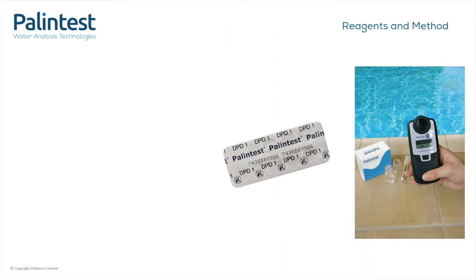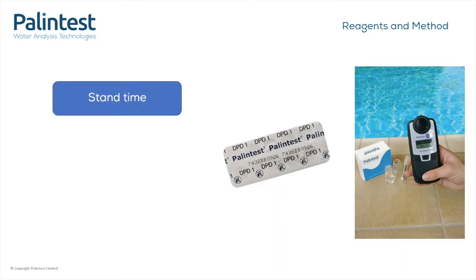The first thing we always check when a query comes in is the method and the reagents. There are a few things that we've spoken about in previous webinars, like making sure that you use in-date reagents and ensuring you use them in the correct order where necessary. But this is our tech support checklist, and these are the first things that we try when a query comes in. What I'll give you is our top three things to check when carrying out a photometer test. The first is to follow the method carefully. One of the key things is making sure you adhere to any stand time instructions. The stand time is what allows the chemical reaction to occur and the colour to fully develop, and helps to ensure that you get the best results.